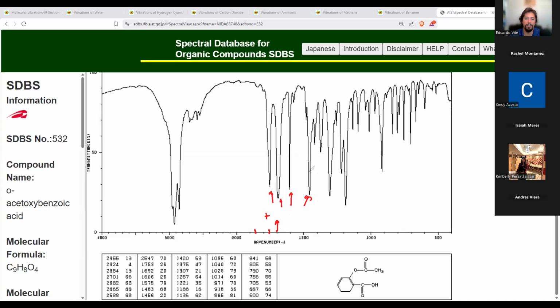You're saying anhydride. Well, this looks like an ester compound here, and this one looks like a carboxylic acid. So anhydrides, they look similar, but they have their own structure as well. So that's a very good guess for sure. But we can see from here directly that it's ester and carboxylic acid, and both of them have carbonyls, right? So those are the peaks that we start with.